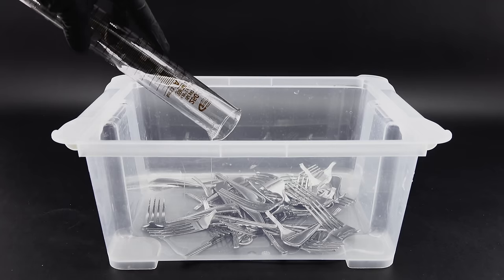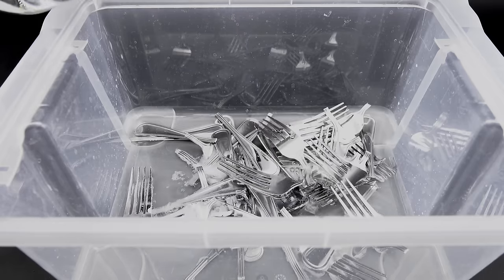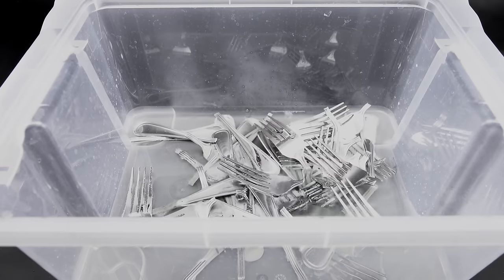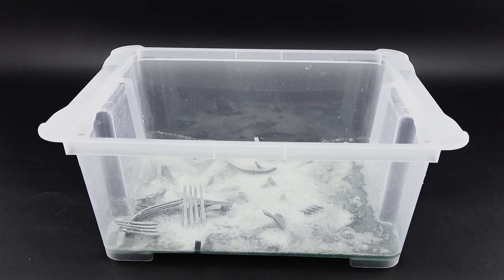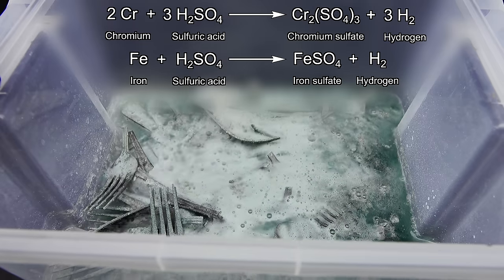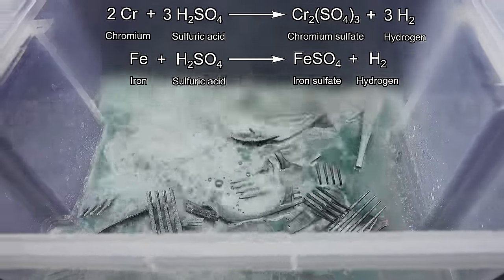As expected, just the acid didn't do anything, because for the reaction to occur a good amount of water has to be present. I added some water into the acid, and the forks started dissolving almost immediately. I know that triggered a lot of people, since you really shouldn't add water to concentrated sulfuric acid, but since I am working in such a big container and have appropriate PPE, everything was fine. After a few minutes the reaction really took off, producing a ton of gas and making the acid solution green. Sulfuric acid attacks the chromium and iron in stainless steel, turning them into their sulfates and producing a large amount of extremely flammable hydrogen gas, which is why this reaction can only be done in a fume hood or outside.